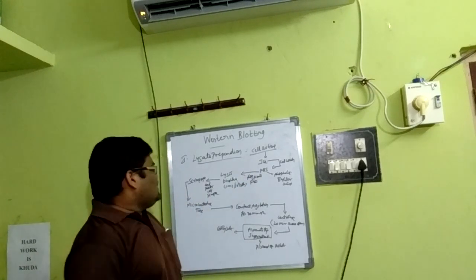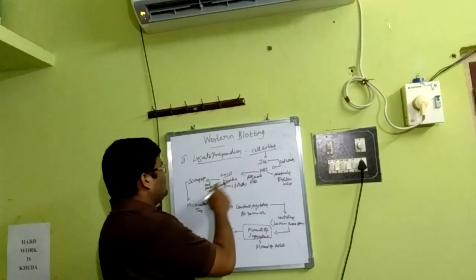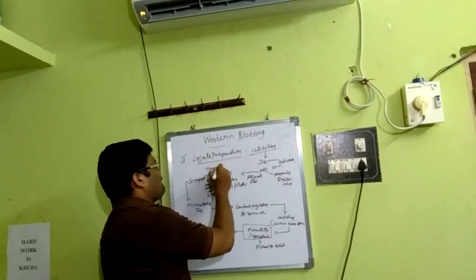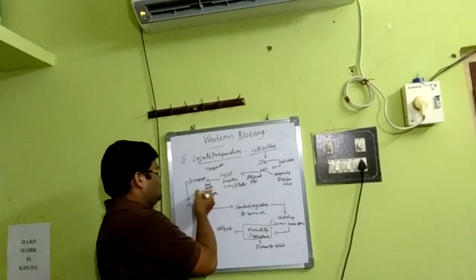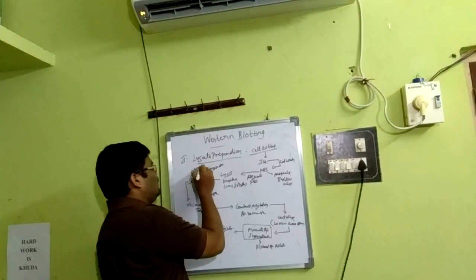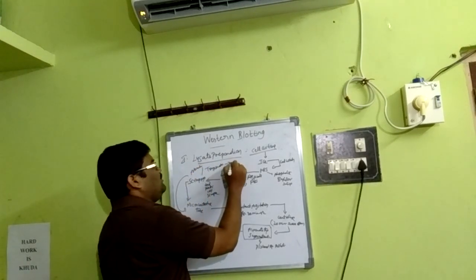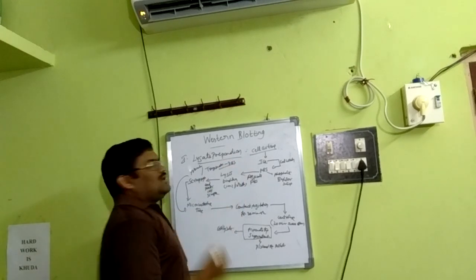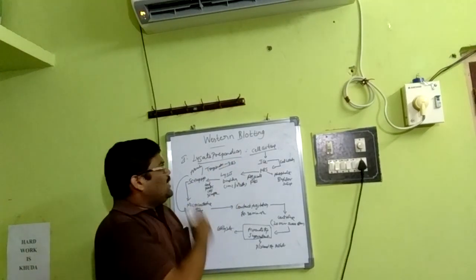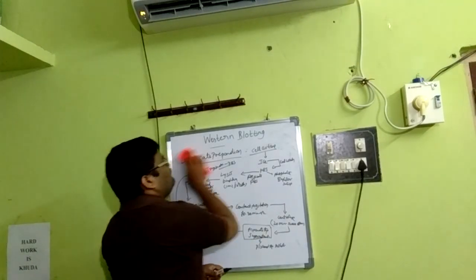Another thing is here we can use trypsinization. Before we transfer to the microcentrifuge tube, an alternate route is also there: trypsinization followed by PBS. It is also one of the alternate routes for this particular step. Okay, this is about lysate preparation. And so at the end we got the lysate.